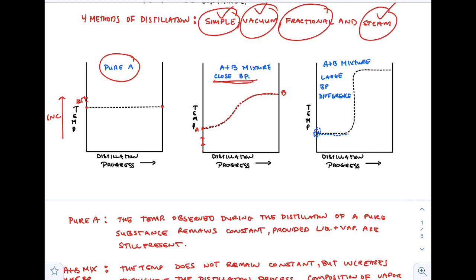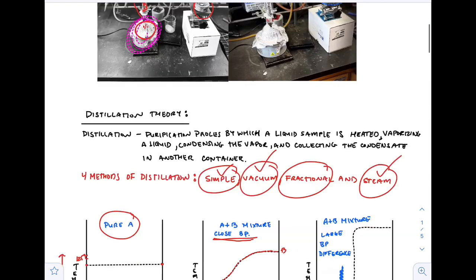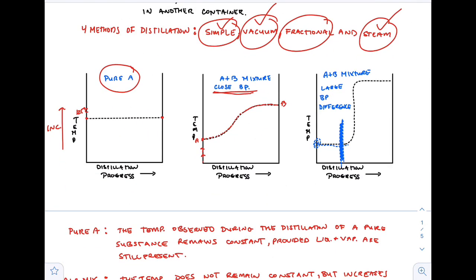So what we could do is heat, collect, and then at this point switch the flask, as in this flask right here, throw that in the garbage, and then put a new one on there, collect while this is going up into a much higher temperature, and then ditch that flask too, because whatever is collected in this range is probably a mixture of A and B, and then once we get to the top, we're going to have a cleaner composition of B. So this would be A down here, and on the right B.